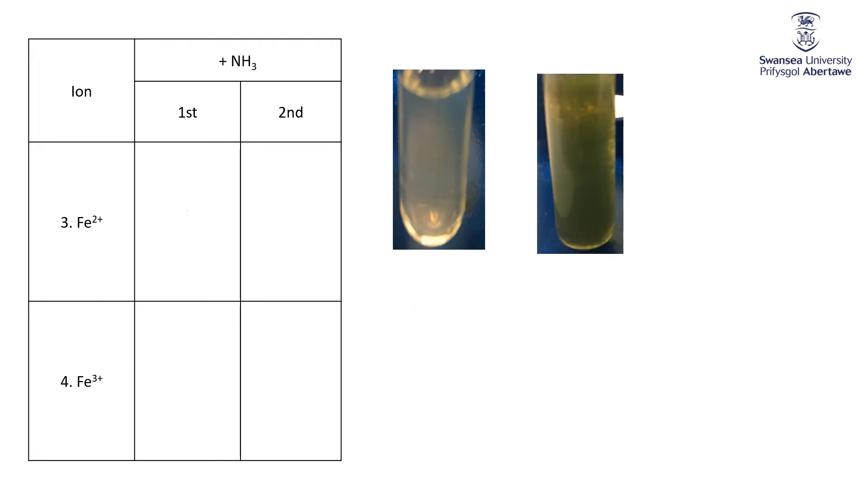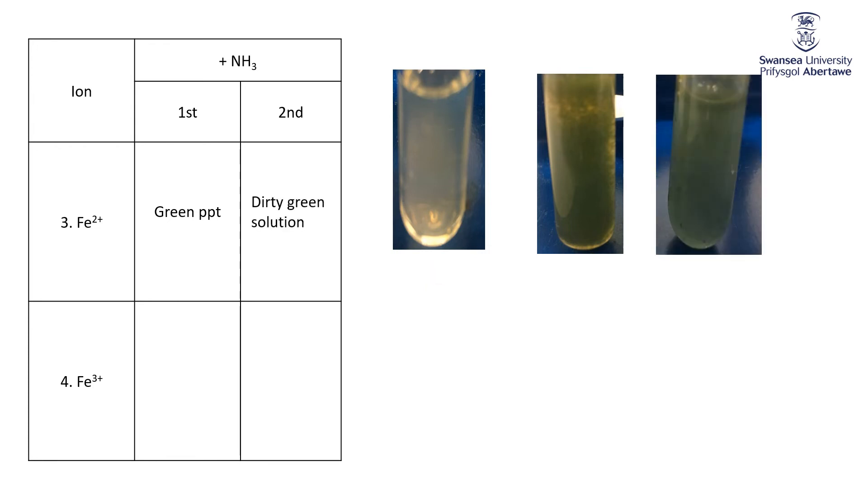Again, you don't need to know this for the A-level, but repetition of the concept is always good. And Fe2 plus, remember, starts off as that, because actually it kind of almost looks reddish there, doesn't it, with that perspective? But that's that yellowy green solution. We add in some ammonia and we get that green precipitate, that dirty green precipitate that you saw when we added the hydroxide to it. Keep adding ammonia to it, and it goes to a dirty green solution. You can start to see the solution up there, a little bit of precipitate floating around.